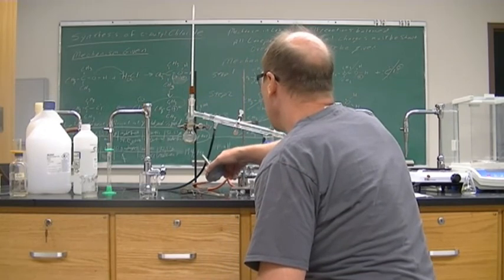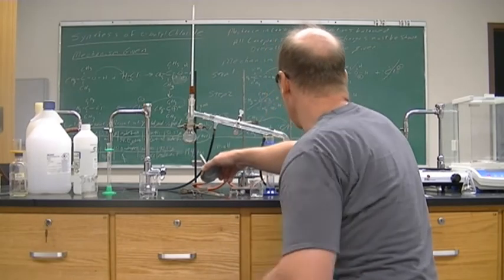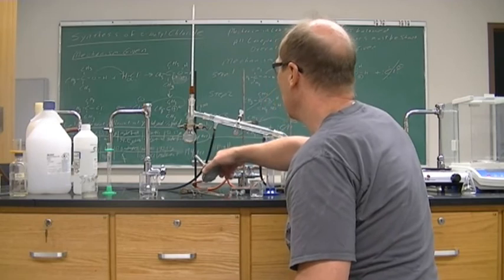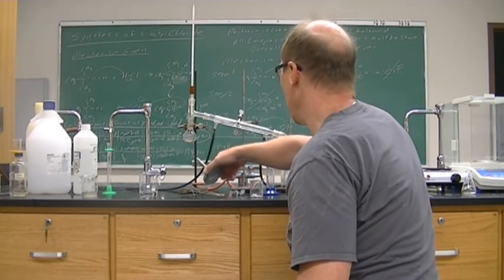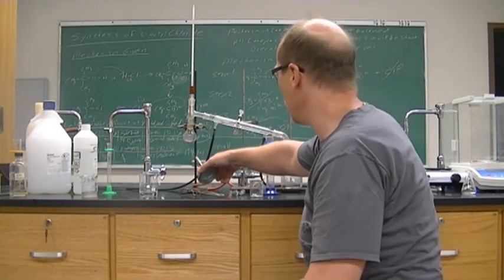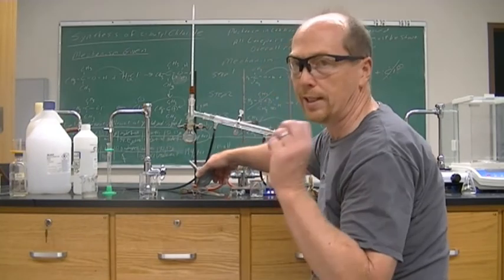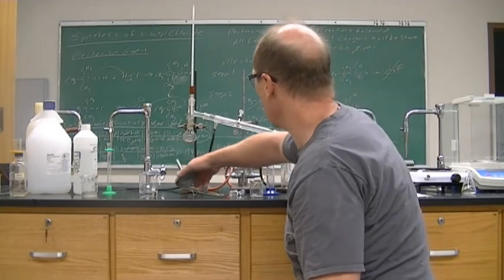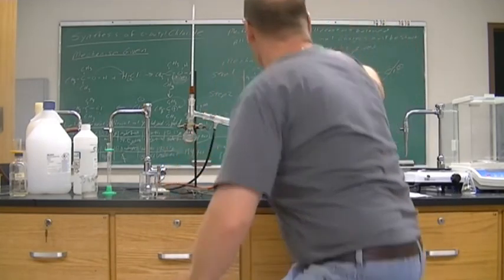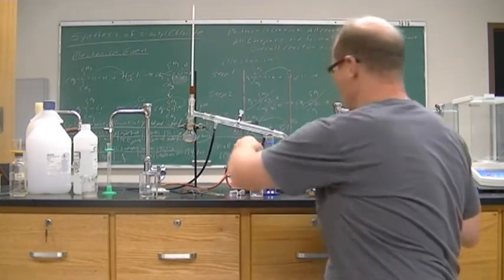Good thing we waited before, because of our volume, and there's a couple of drips coming over, which again, when you have your NMR, would be nice. Then you would have your pure t-butyl chloride to test. You get a nice IR, a nice NMR. You hardly need any product at all to get a good NMR. The good point is, it didn't take long to do the distillation. The bad part is, we have a very, very small amount.